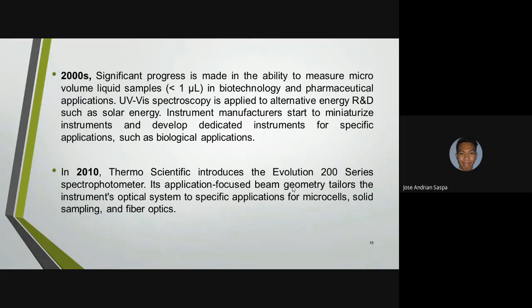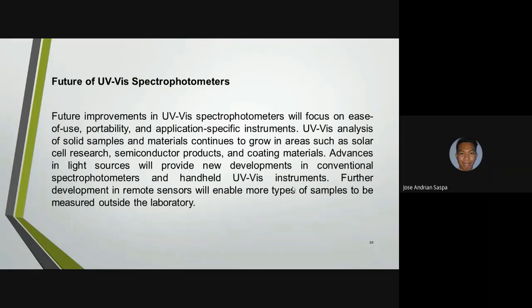In 2010, Thermo Scientific introduced the Evolution 200 series spectrophotometer. So about every 10 years, there's a development in the application and function of the UV-vis spectrophotometer.